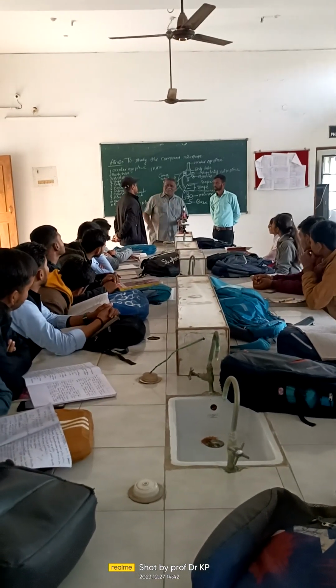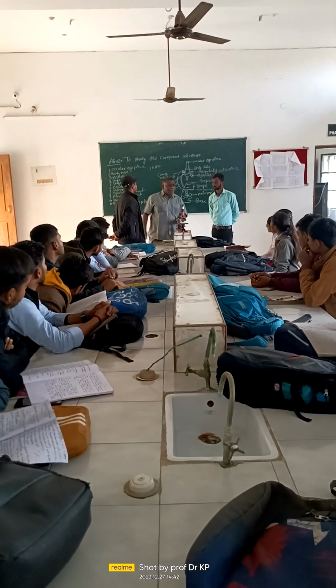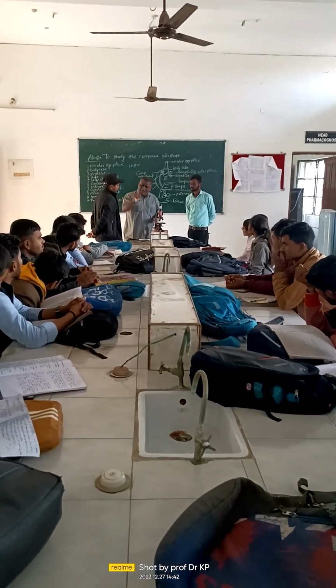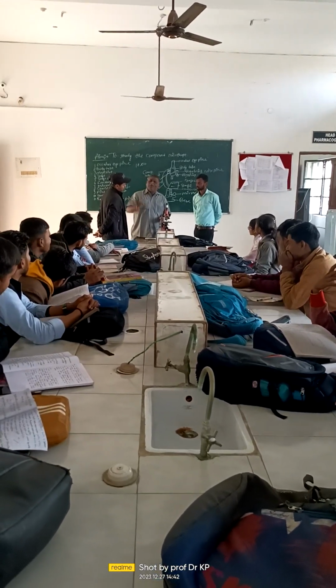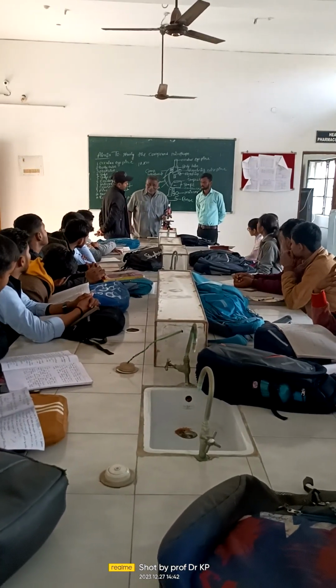But for student purposes, mostly 10 into 10 will be preferred in most conditions. Rarely in pharmacology, like seeing individual organelles of a cell, or an individual cell, or enlarging particles, cells and materials, you will be using 40x.